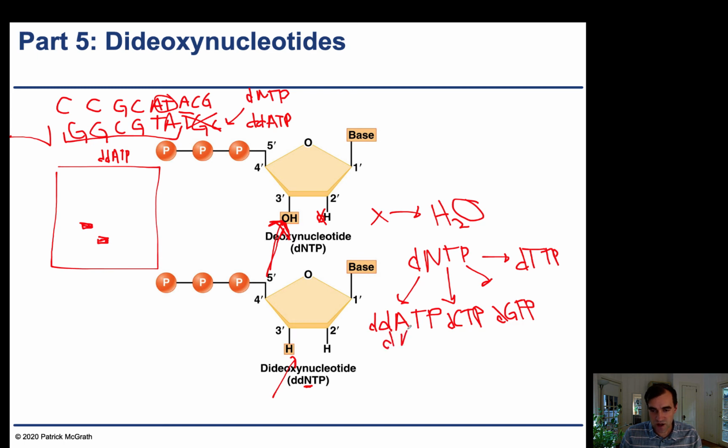you have a mixture that has dATP and ddATP, what happens is that some of the sequences read through because they incorporate the dATP, and some terminate. And so some of them would go on to the next one. So I think this activity will hopefully make this all clear. But if you have a mixture, then you can start to see multiple bands for each thing. And so in combination, you can then actually figure out the sequence that way.